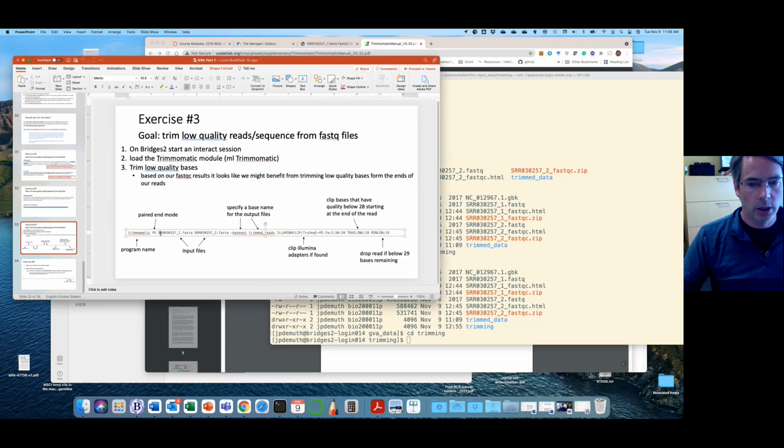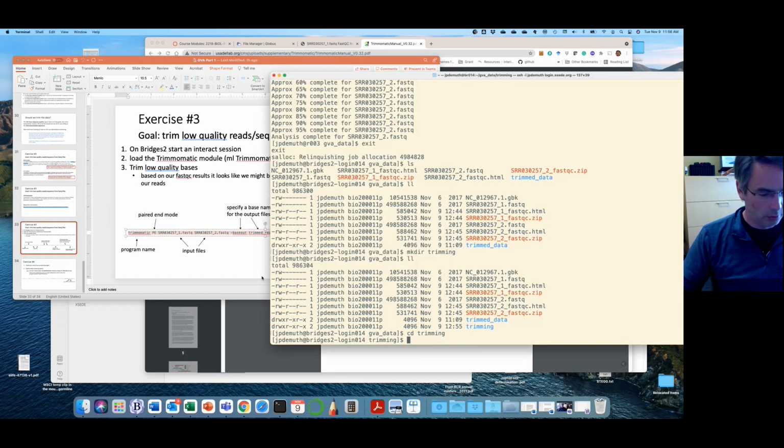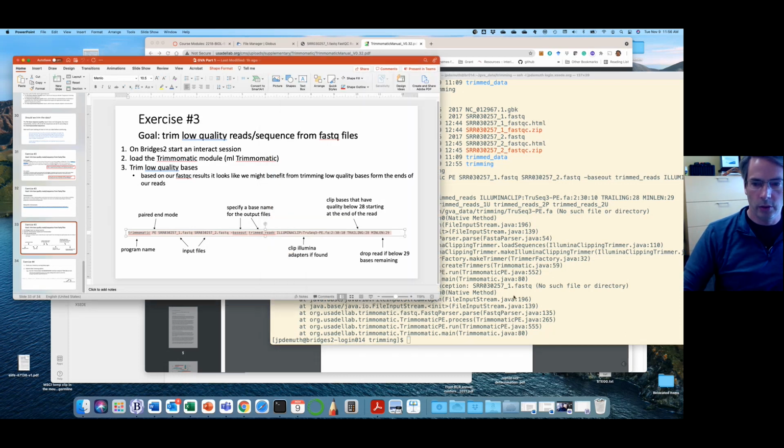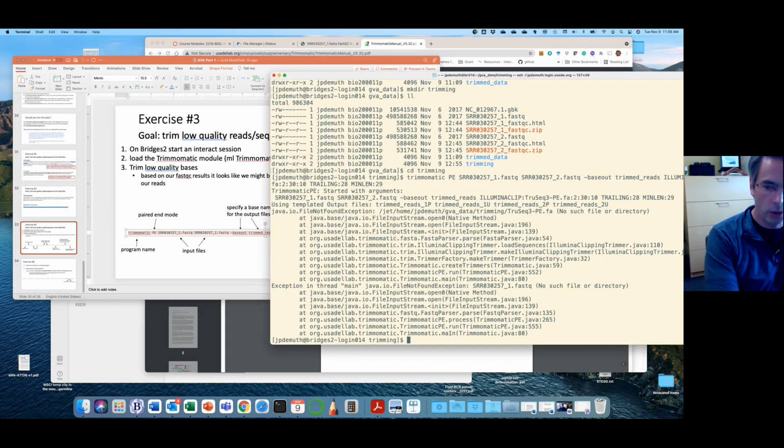And now I'm just going to copy this command, that way I'm sure I don't make any typos. Whoa, I didn't mean for it to execute. I must have copied the enter, and so it already executed, and that was really fast.